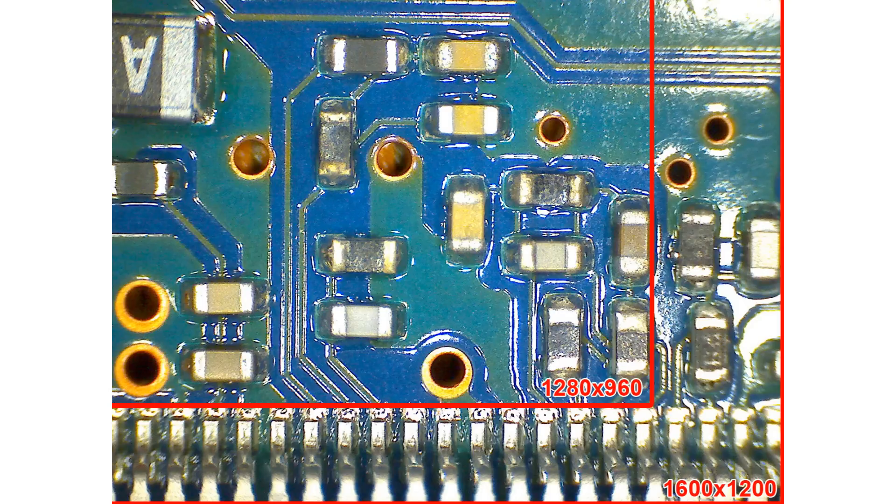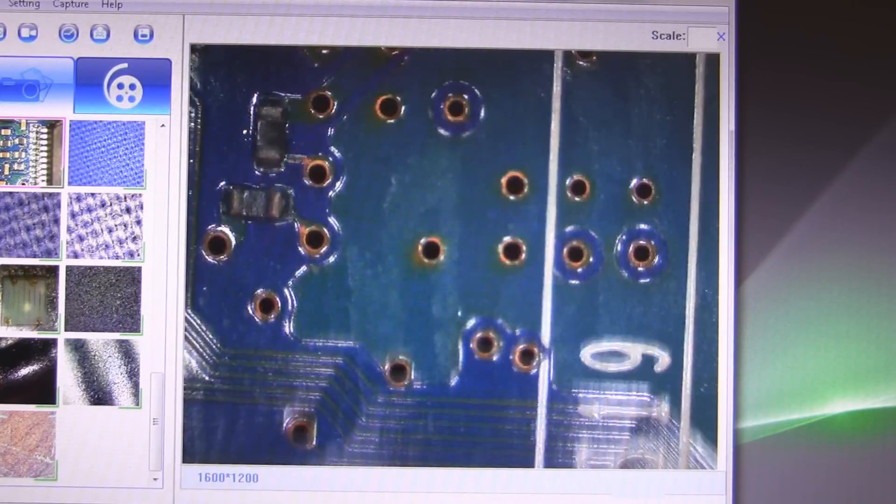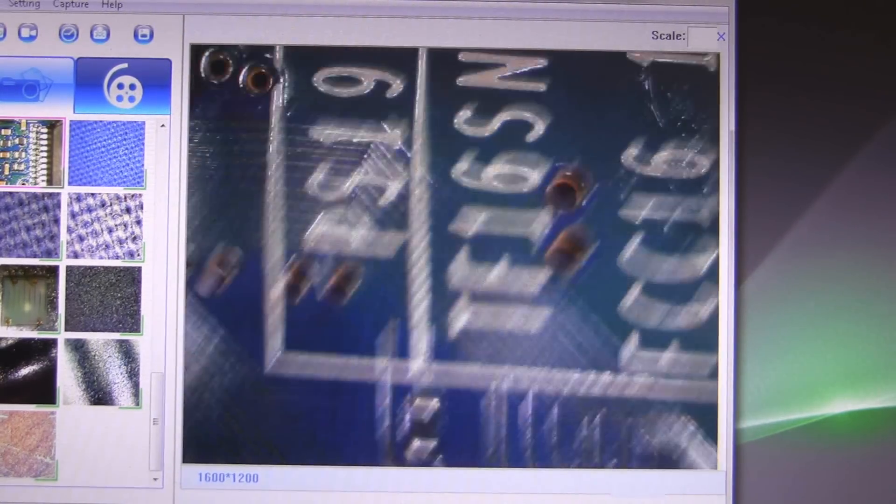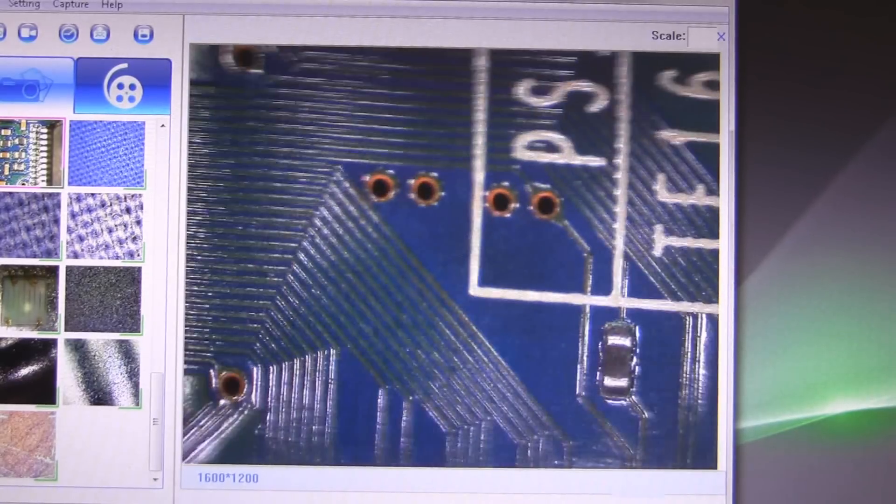When capturing images, you get the choice of 1280x960 resolution or 1600x1200 resolution. You should know that the higher resolution setting doesn't mean that more detail is getting captured. What happens is that 1600x1200 captures a wider area, and 1280x960 is a cropped image. By capturing the smaller area, you get faster frame rates. In most situations I would actually recommend sticking with the lower resolution, because you get a strong jello effect at 1600x1200.